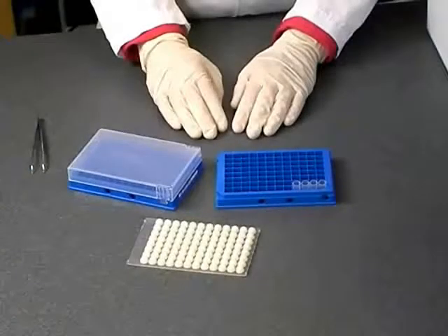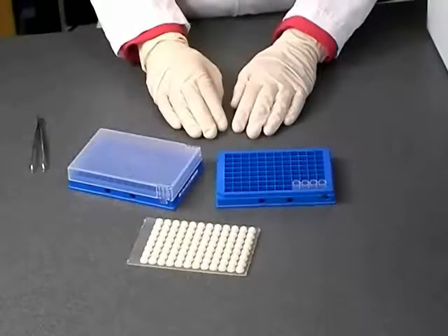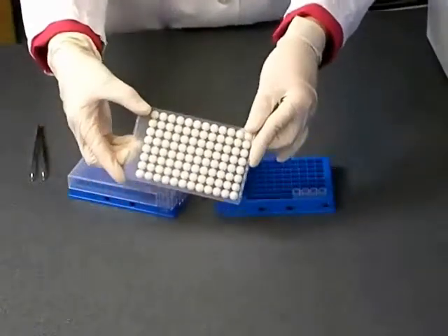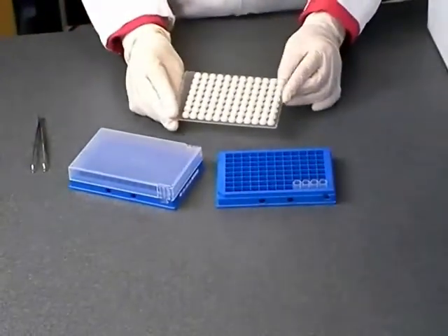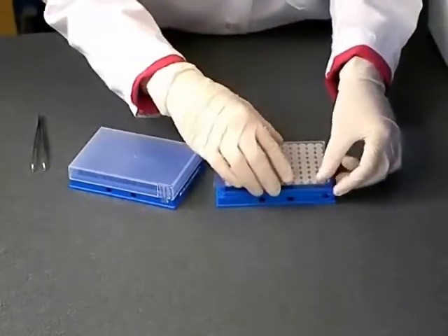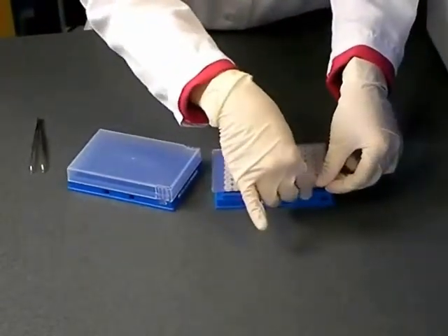After drying the Gentagra tubes, you should cap the tubes prior to storage. Using the Gentagra cap mat, securely place a cap on each of your tubes by laying the mat over the top of the tubes and pressing each cap onto the tubes.